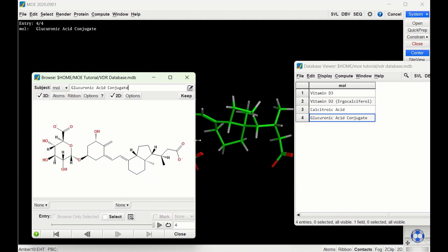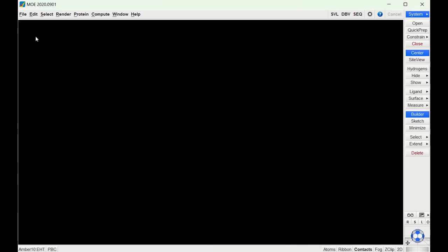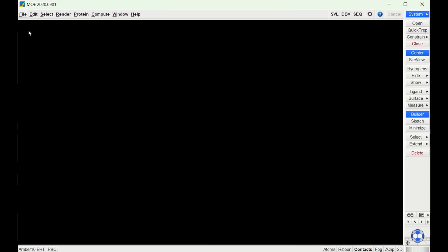For the glucuronic acid derivative of calstroic acid and for calstroic acid itself there are carboxylic acid functionalities, and we have those deprotonated so that they are correctly deprotonated under biological conditions. We can go ahead and close the browsing window and open up the vitamin D receptor that we have prepared.